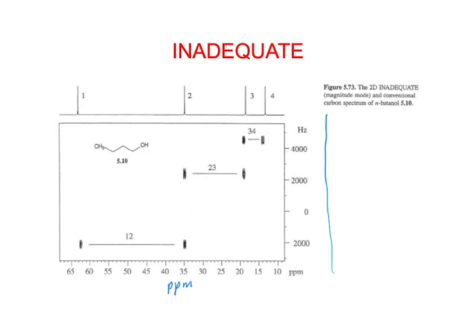And the way that we do this is we observe coupling when we have 2 peaks that are horizontal to one another. Okay, so coupling is horizontal. So it's not like a COSY spectrum where we have a diagonal. It doesn't really work that way.